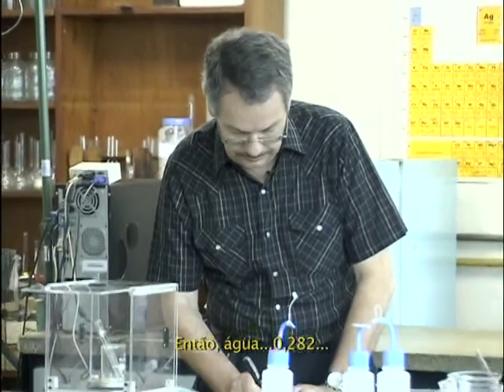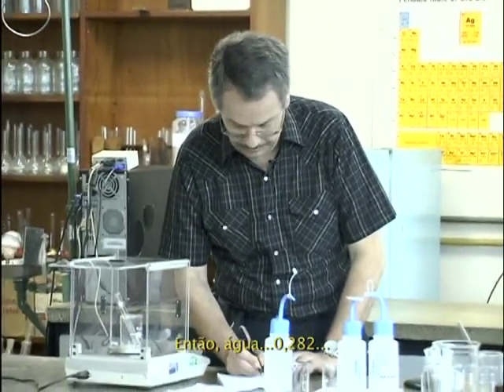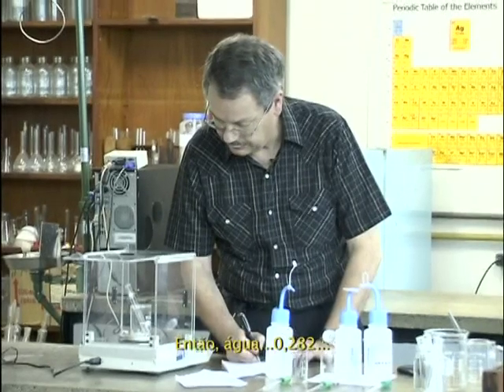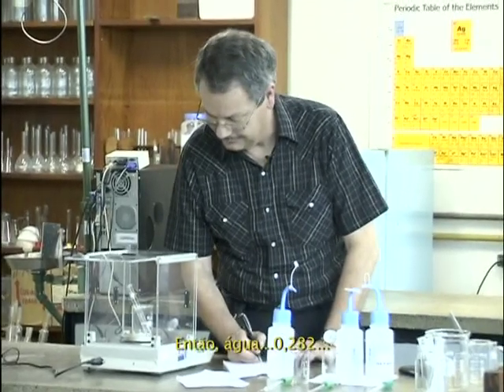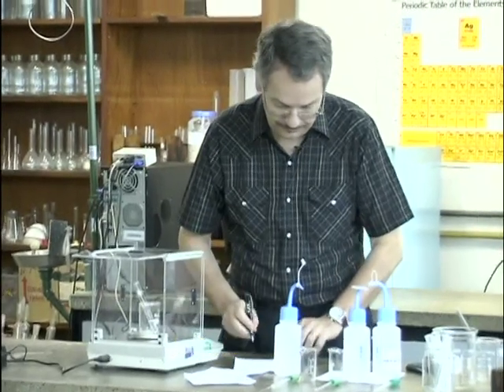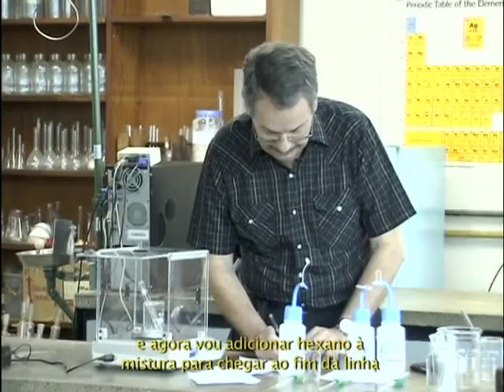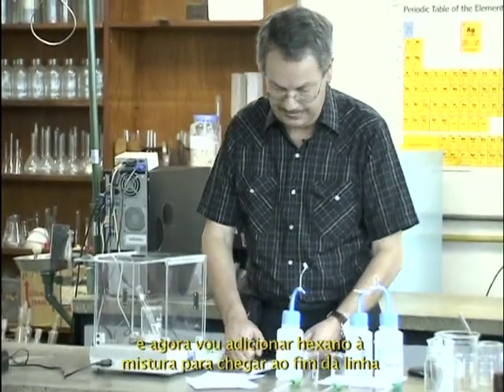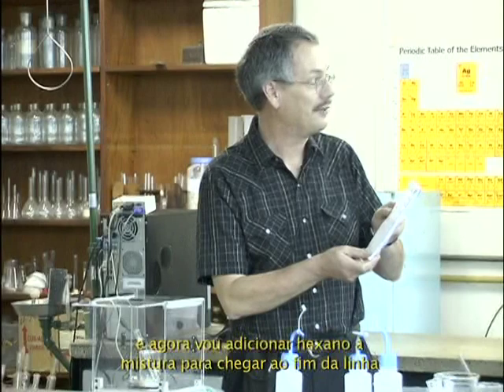So water 0.28. That's strange, it's 4 now. That's 2. 0.282. And now I am adding hexane in this mixture to get the end of the line.